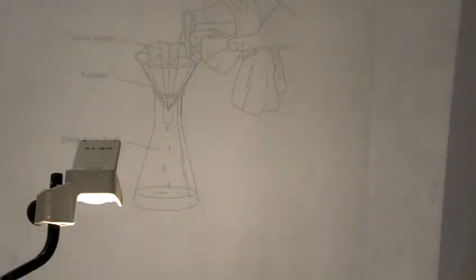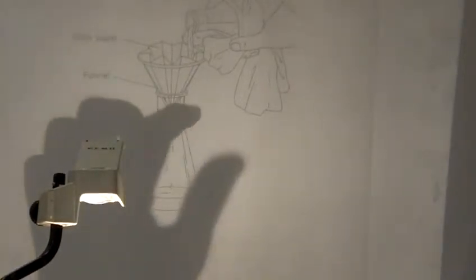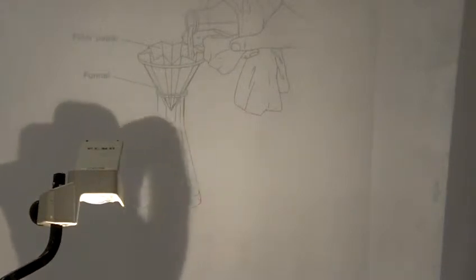When you are stirring your nutmeg in your Erlenmeyer flask before you actually go to filter it, keep that covered with plastic wrap as well, okay? So you want to make sure you don't lose your ether. You're trying to prevent it from evaporating on you, so you've got to keep everything covered because ether evaporates really quickly. The other thing is when you're doing the extraction, just the stirring and doing the filtering, make sure you keep things clamped too so things don't fall over in your hood as you're doing things.